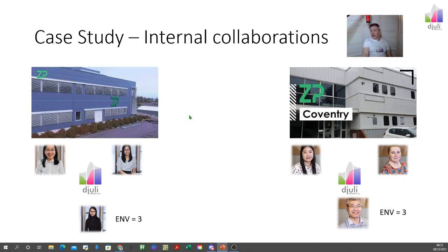Now, in these days of when I'm making this video, in days of COVID-19, it's actually very useful to have these disparate groups, because when you have lockdowns and shutdowns in one country, it doesn't necessarily affect another country. So we need to coordinate both these teams, both from an efficiency perspective, but also from a sort of project security position. So we do have them well coordinated through djuli.